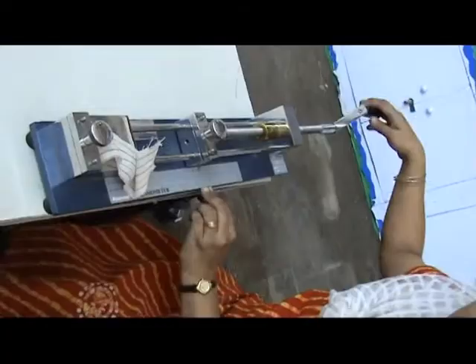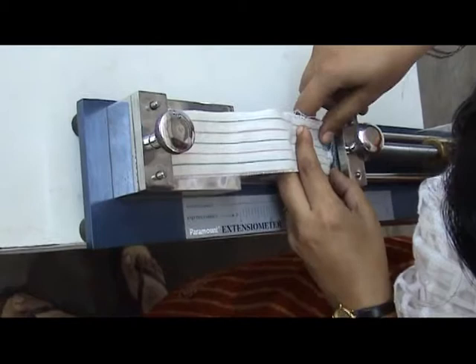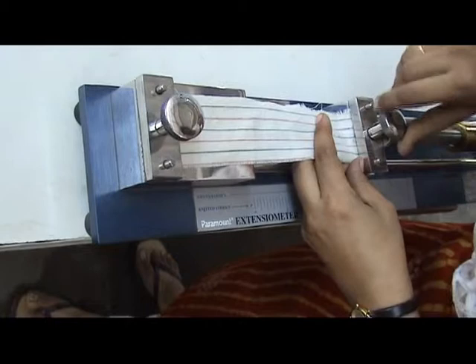The extension and recovery of a fabric sample can be measured using this instrument. The elastic recovery of fabrics, which is one of their most important properties, can be determined at different extensions using this instrument.